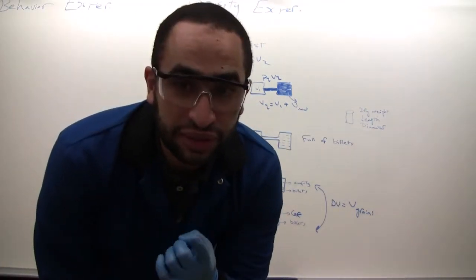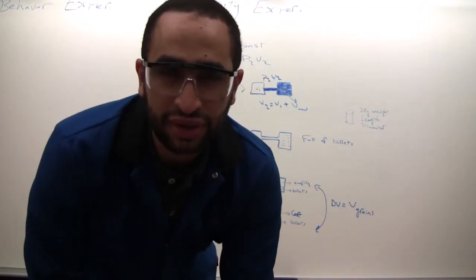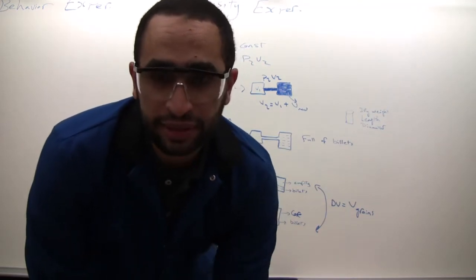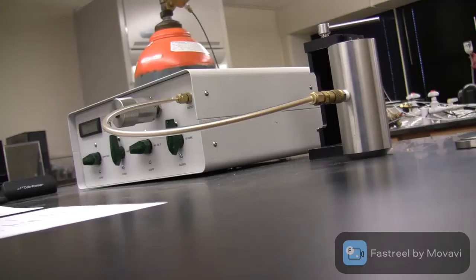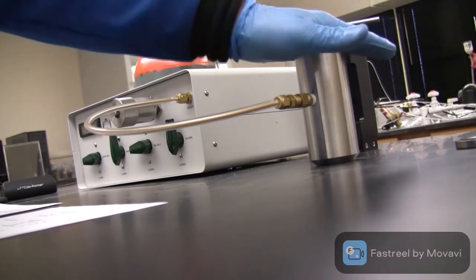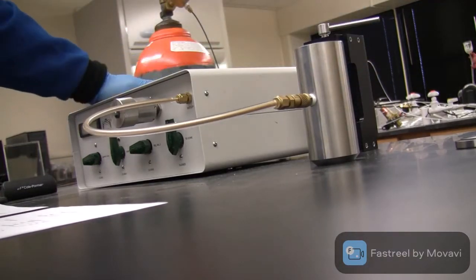Now we will go to the system and see how to do that. It's going to be a little bit boring because the steps are too long, but we have to follow them step by step so that the experiment goes well. So now we start our porosity experiment. As you see, this is the first cup, or actually the second cup, the one that we put our billets and core in, and the first one is inside the instrument.